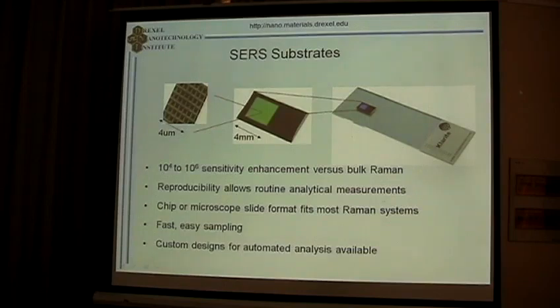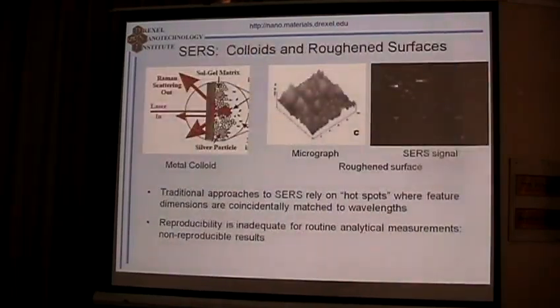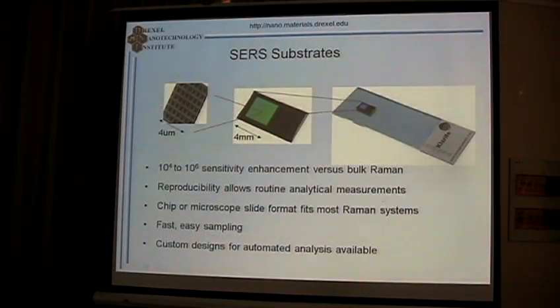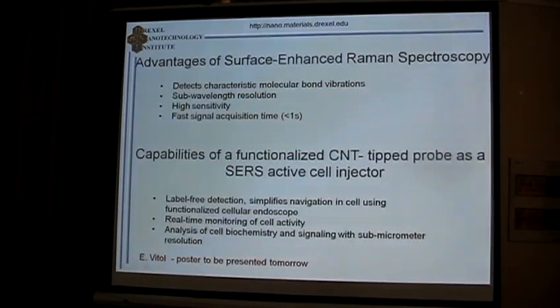And there are several ways to conduct surface-enhanced Raman spectroscopy. Let me go back for just a second. The conventional, most common one is just using agglomerated particles, relying on hot spots between the particles, or using a scratched, roughened surface, again getting enhancement on certain occasions. The problem with those is that they are kind of a random enhancement. You enhance it in one point, less in another point, you don't know exactly the level, it's very difficult to control. One way that industry is using now, like Clarite, produces substrates which are microfabricated. It's kind of a photonic crystal made in a metal surface.